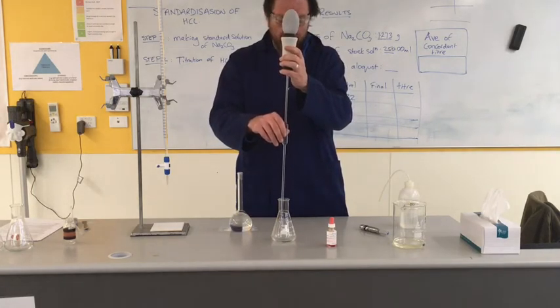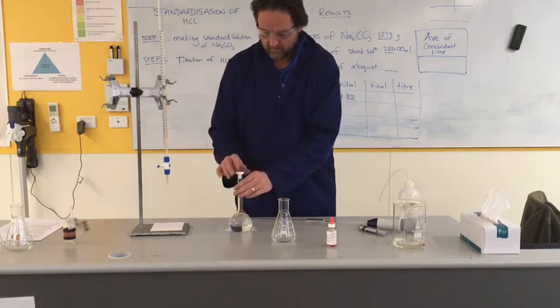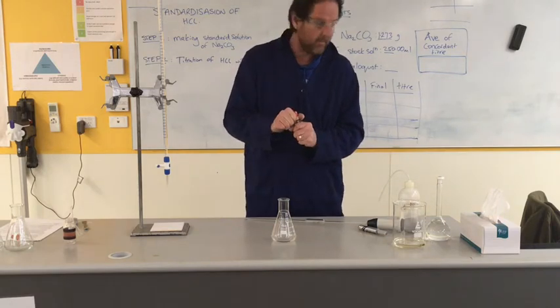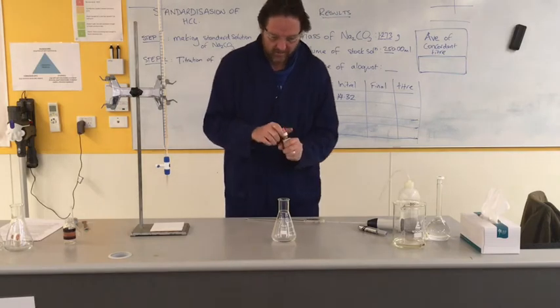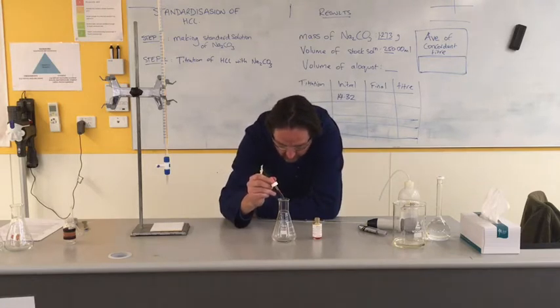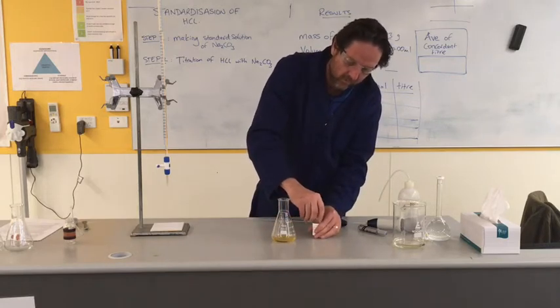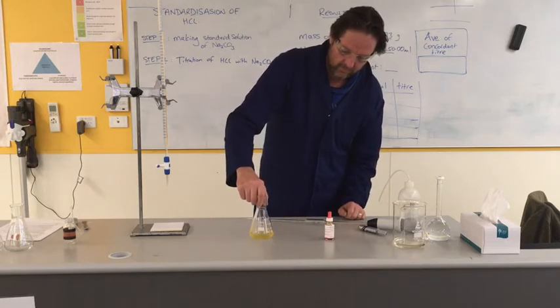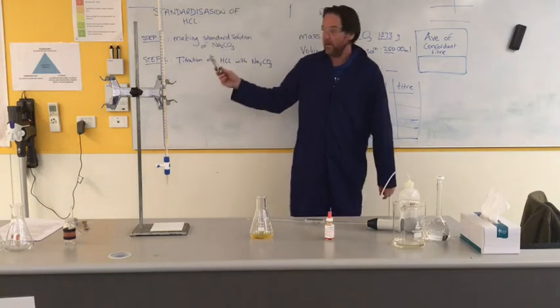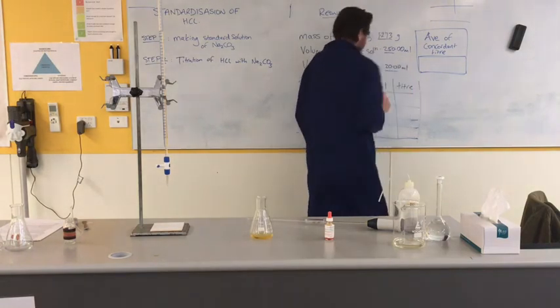Last couple of drops - three taps. Now I'm going to add in three to four drops of indicator. Not really important if it's three or four, as long as I do it the same every single time. I want to get about four titrations. This indicator is methyl orange. Four drops - I'll give that a little swirl around. The volume of the aliquot - the aliquot is how much of my sodium carbonate I put in there. It was 20.00 ml.